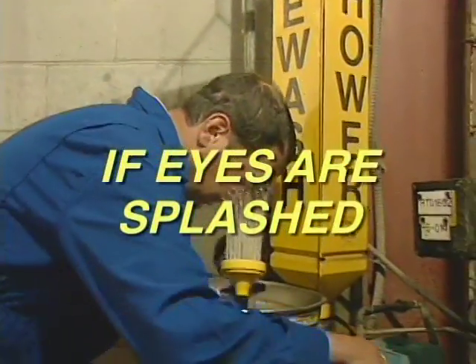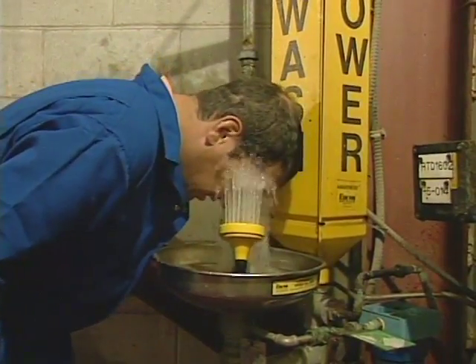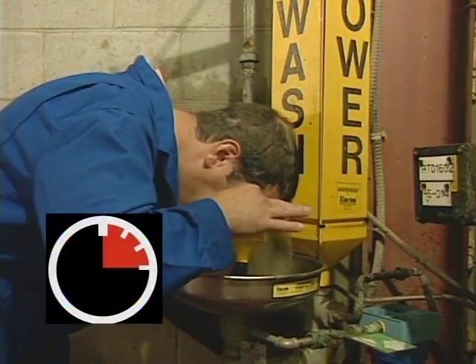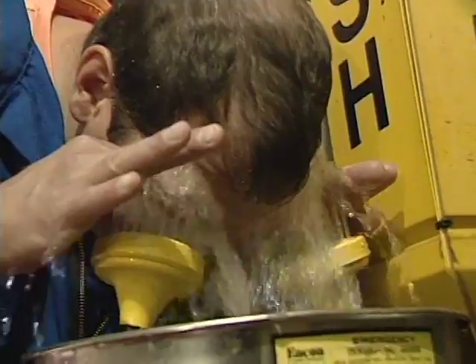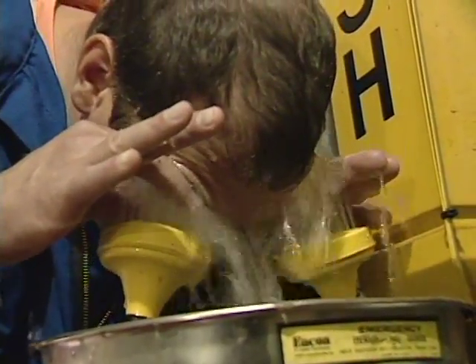If eyes are splashed, immediately flush with water for a minimum of 15 minutes, longer if burning persists, while holding eyelids open. Coworkers should help to keep eyelids open. Then get immediate medical help.